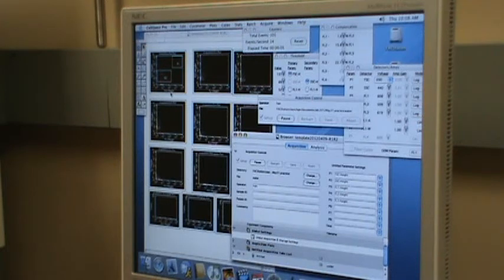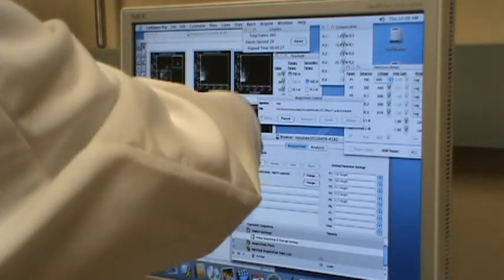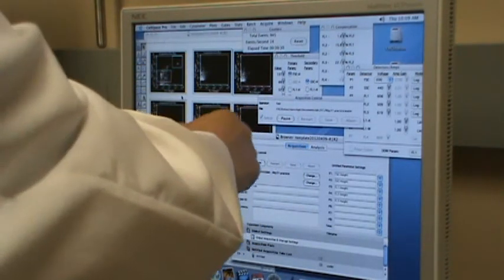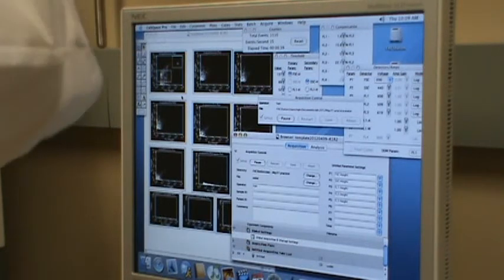You see FSC, forward scattering. This is what they mean, forward scattering. Side scattering is in the vertical direction. The laser is here, your sample is here. So forward scattering is like casting a shadow of your sample. If I have a particle, in the forward scattering, there's a shadow on the screen. That's forward scattering, and that signal is proportional to the size of your sample, because it's a shadow. You basically consider the shadow of your sample.